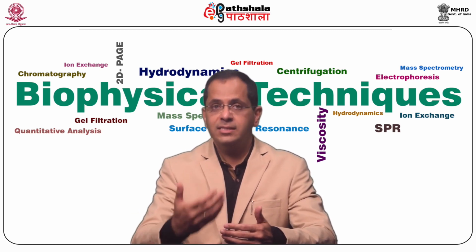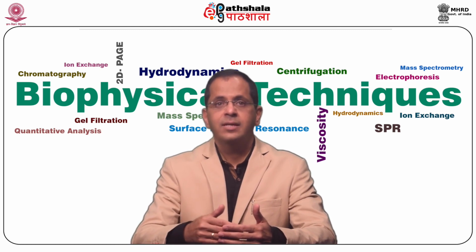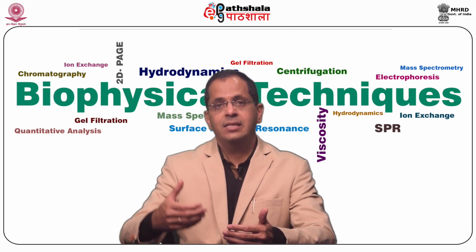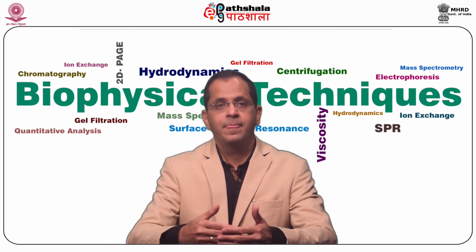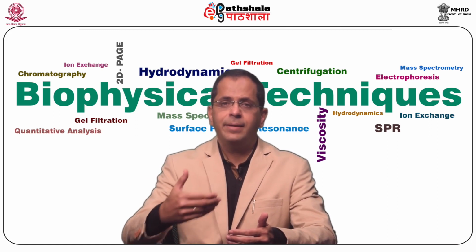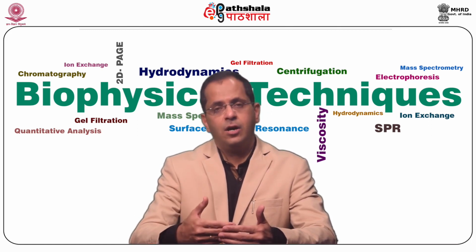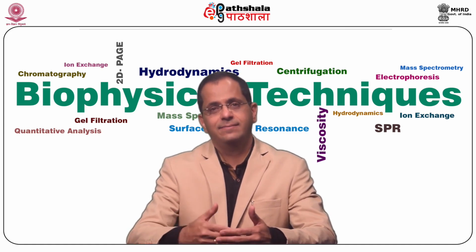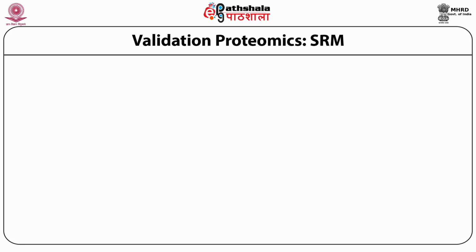Now, what are the disadvantages? The detection of protein isoforms can sometimes be a problem. The intrinsic limitation of mass spectrometry based peptide analysis, or what we have previously discussed as the ion suppression effect. Validation proteomics or selected reaction monitoring.